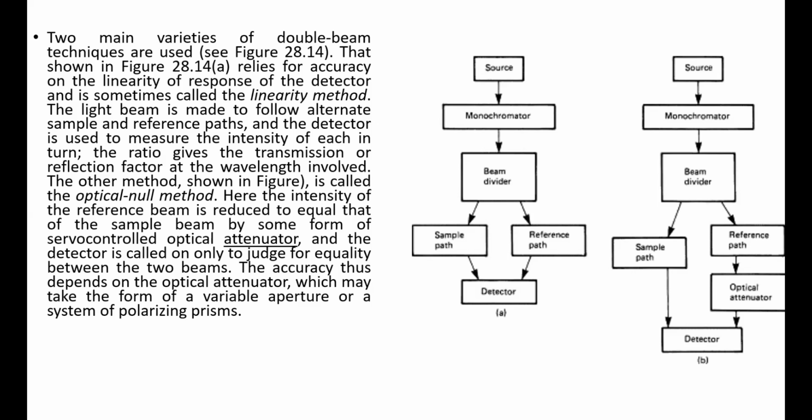Not the experimental methodology. It is about the response of the detector, right? So whether it is detected by the linearity method, what is that? Let's look into it. First, we see the diagram.